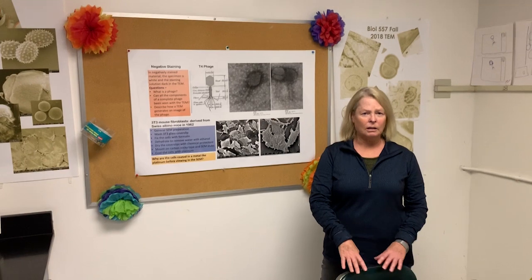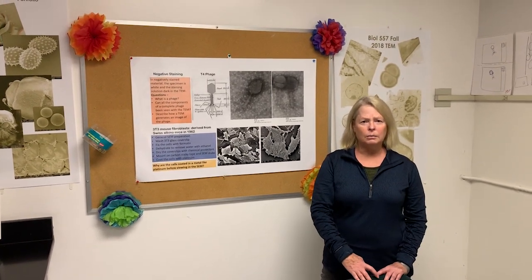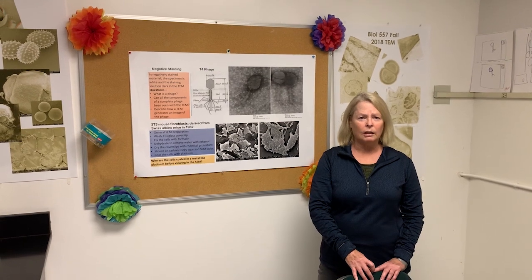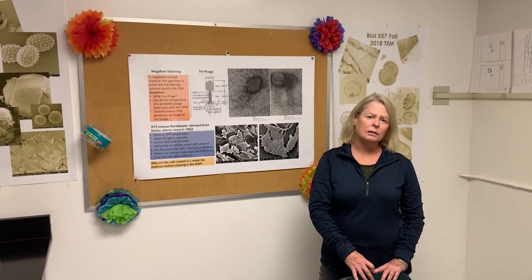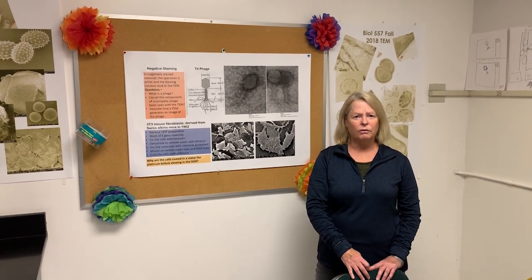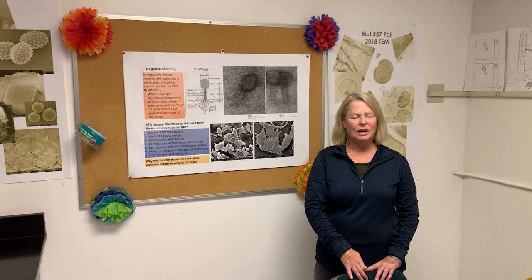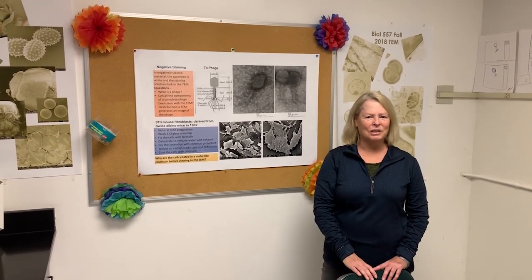He is going to be your guide on the SEM. And David Collins, a JDP PhD student from Marina Kalixnaya's lab, who has been my GA and TA for both of those classes in the past, will be your guide for the TEM. So now you can go with Spencer, and he's going to be your guide.